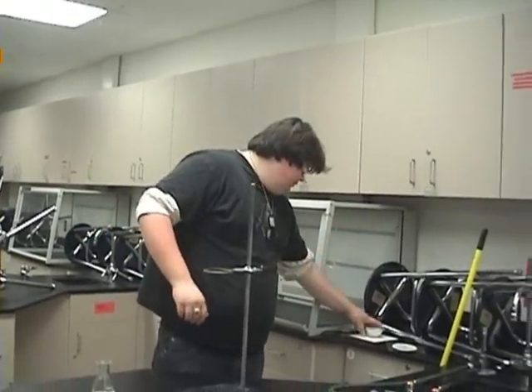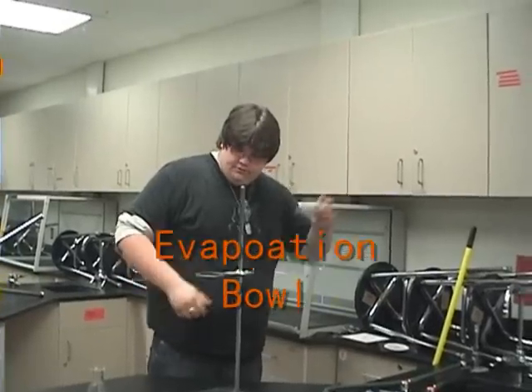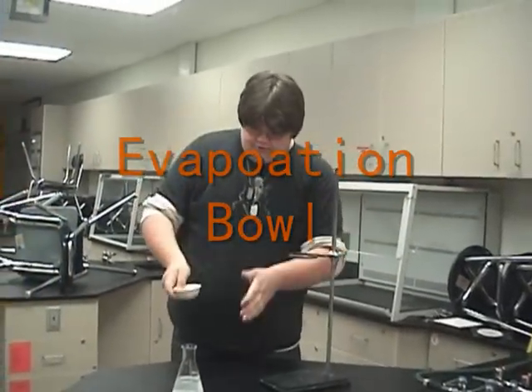Next, we need a wire gauze to finish. This is the dish that you put the salt solution in.